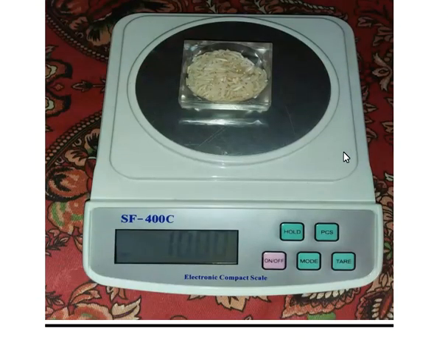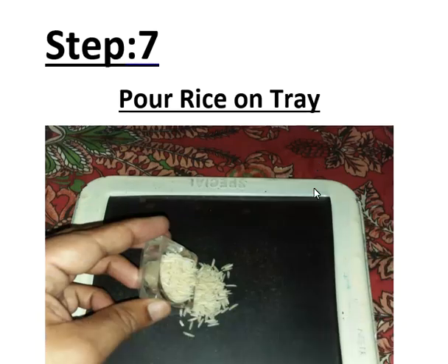Now I am taking the weight of the collected sample — this is basically 10 grams. We are taking 10 grams of sample because when you multiply 10 grams by 10 that gives you 100 percent. So when you tell someone how much broken rice your sample has — say 5% or 8% — you simply multiply the quantity in grams by 10 to get the percentage.